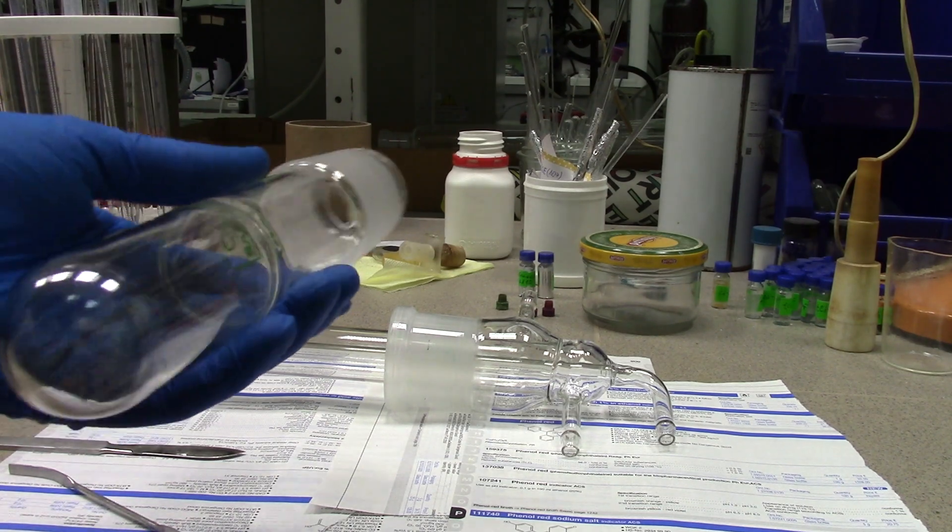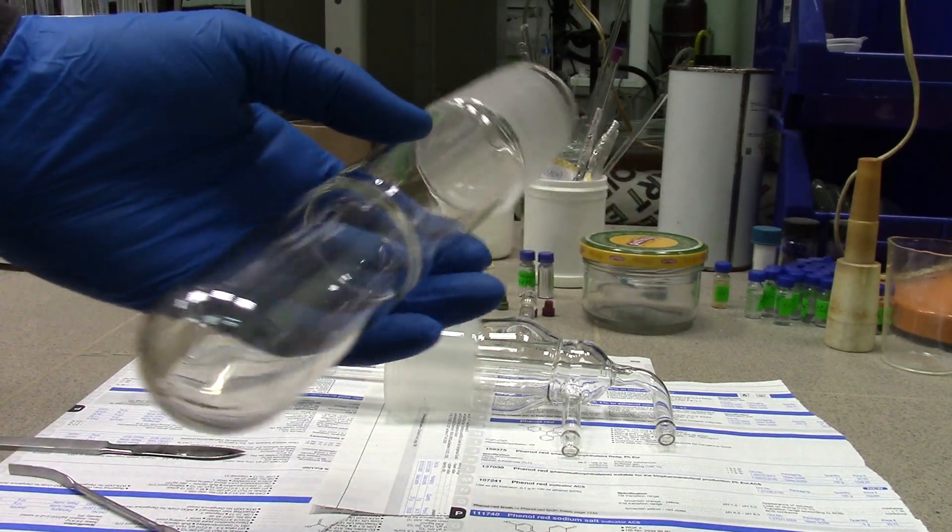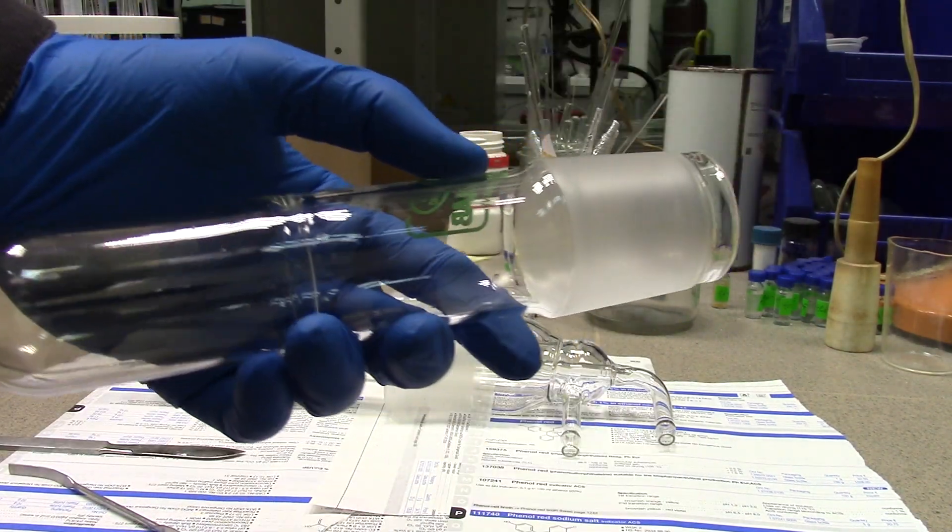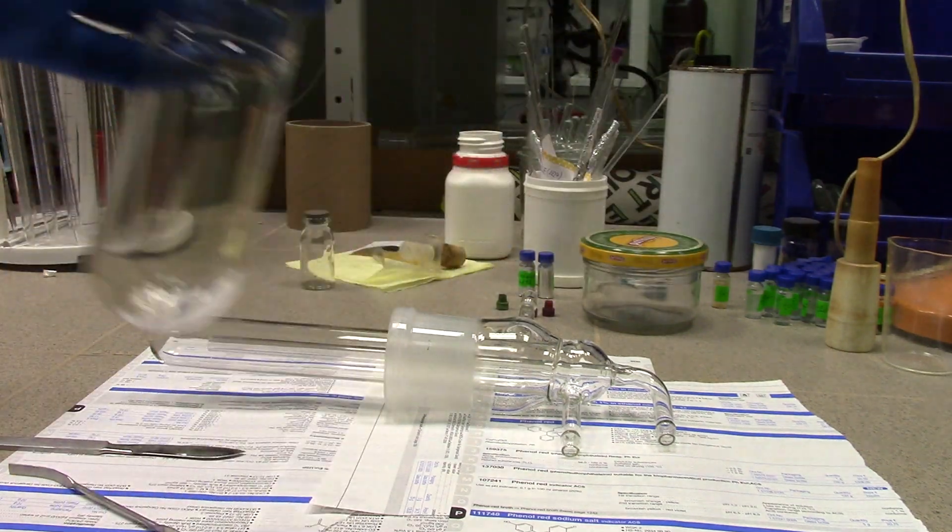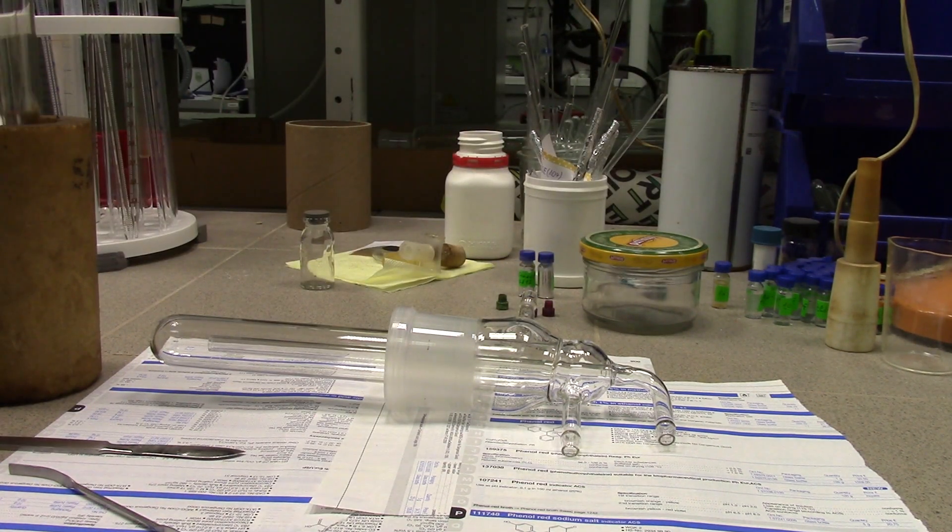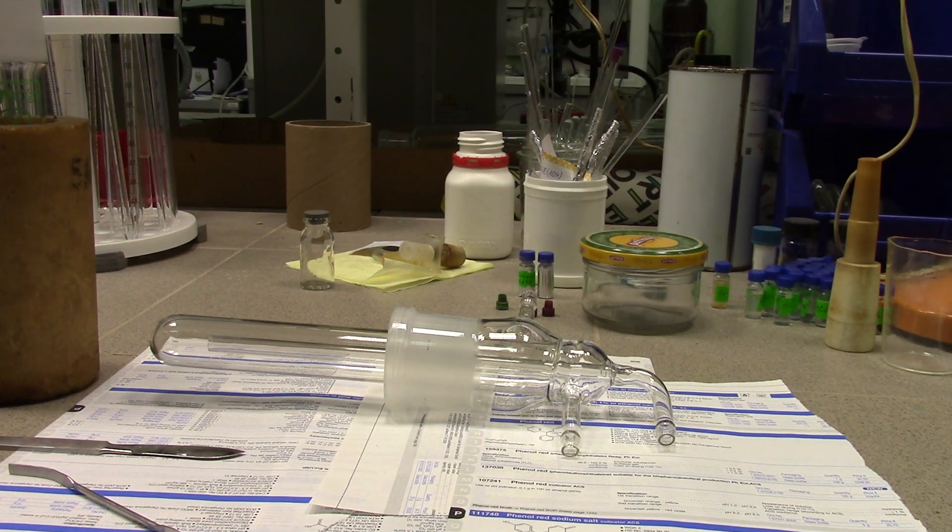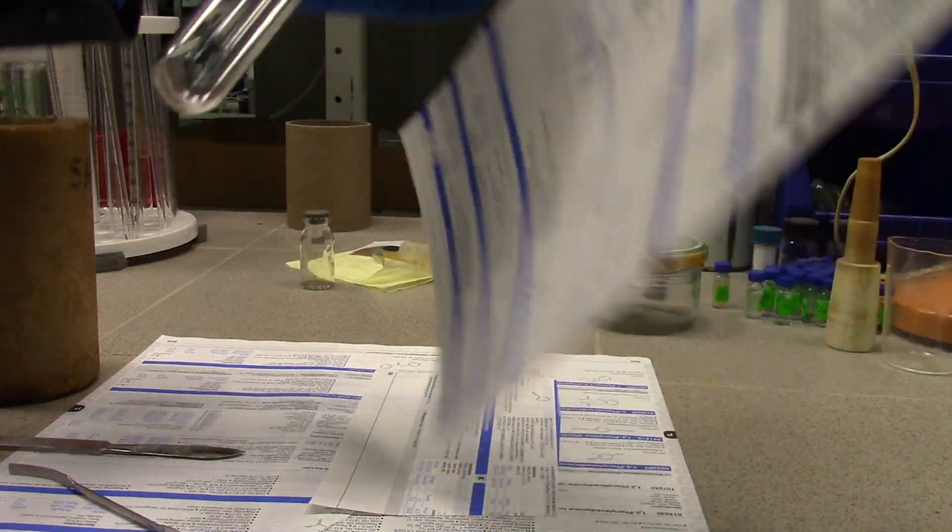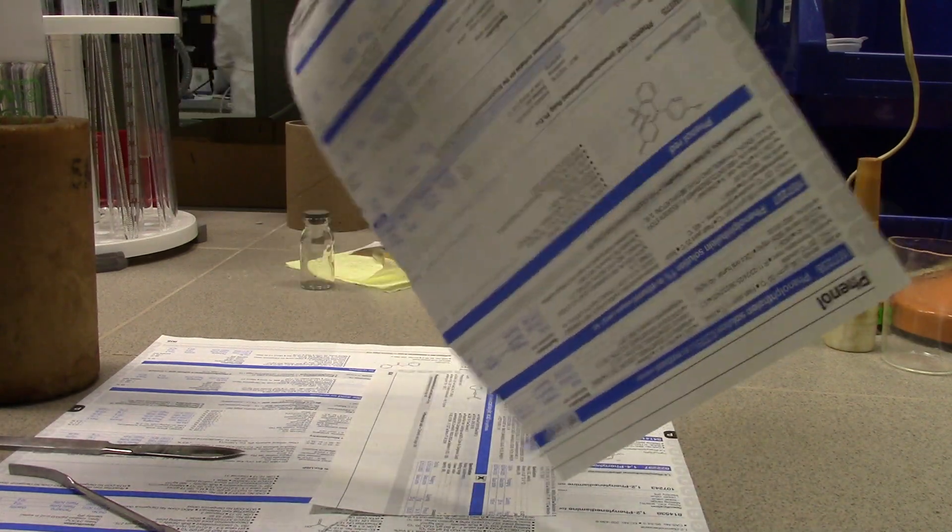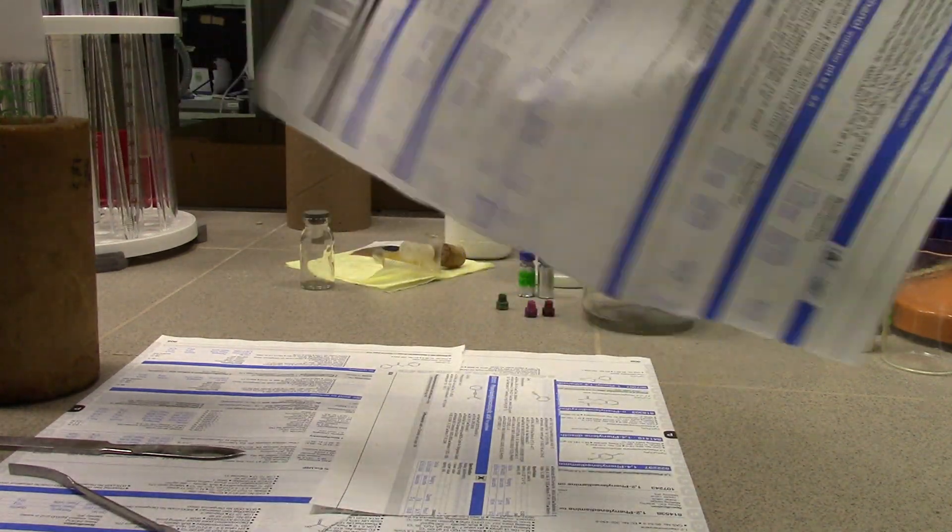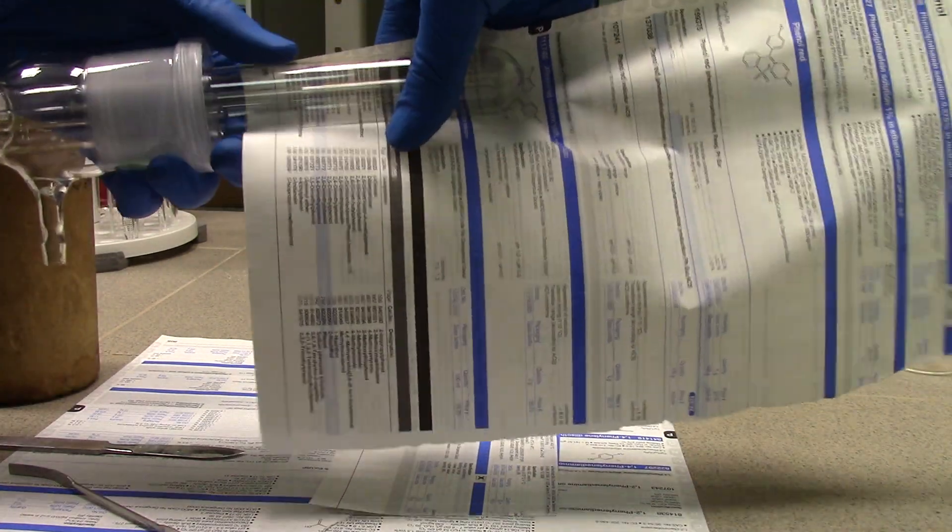First of all you need sublimation apparatus. For simplicity I'll call it sublimator. This is an apparatus base. Before starting all procedures you should cover the workspace using some paper sheets. To move your initial material into sublimator I recommend to make a paper tube to prevent material from contamination.